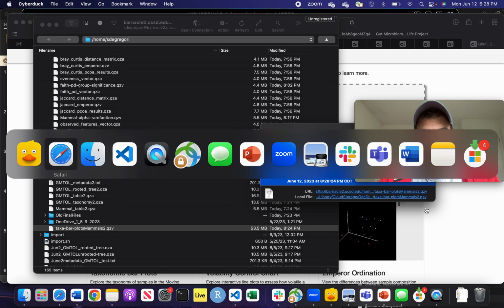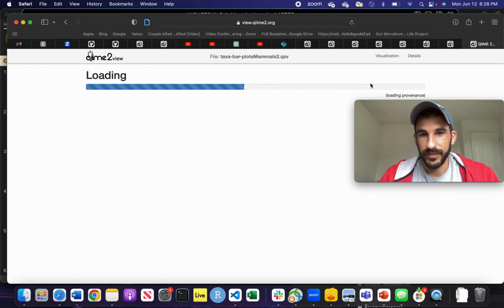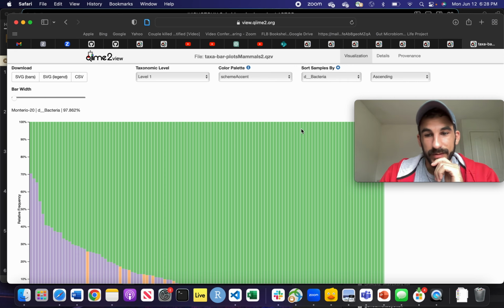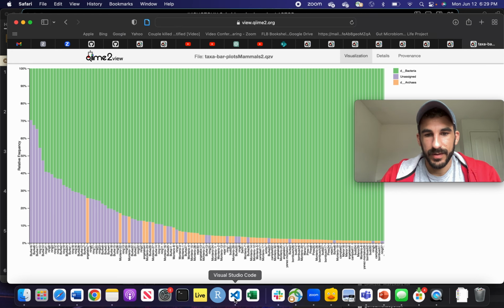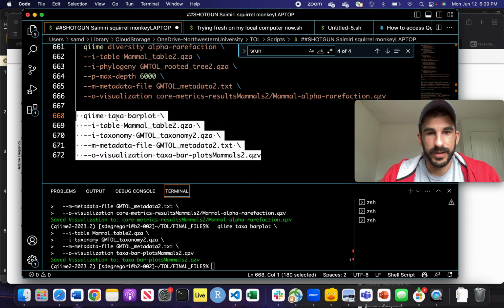So let's see if we can even view this. Okay, so it finally loaded, but you can see that it cuts off, right? So this is not ideal. So if you already had made this plot, that's great. Keep it, it's fine. If it looks like this, then go back, and here's a trick that we can actually do.